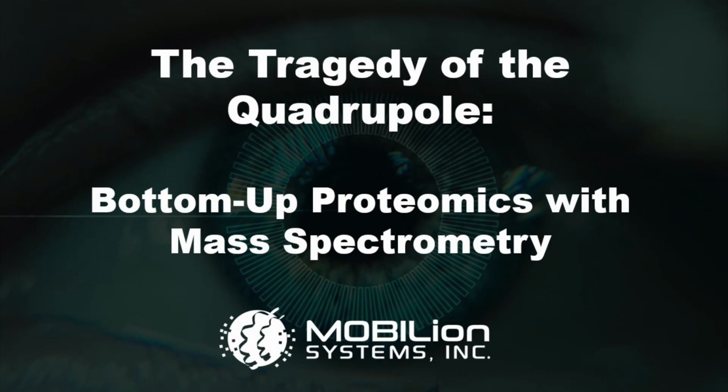Our story today is one of tragedy. We will be discussing bottom-up proteomics with quadrupole filtered high-resolution mass spectrometry. The goal of proteomics analysis is to identify what proteins are in a sample and how much is present. But these insights come at great cost.